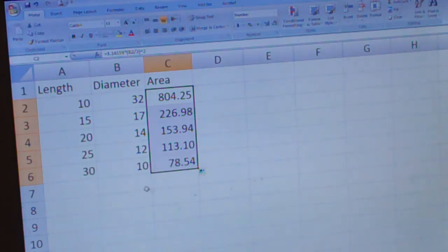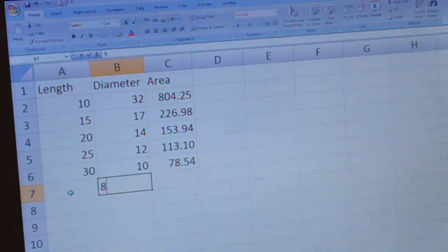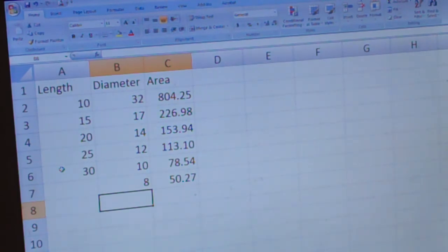The real nice feature is if I now collect some extra data, as soon as I put in another value here, it automatically updated it because it understood that I was doing this in a column. A series of data was being collected. So as part of today's exercise, you'll generate a variety of formulas to translate your mass and volume values into density values. And the density formula is, of course, mass divided by the volume. And so it will be pretty quick and easy.